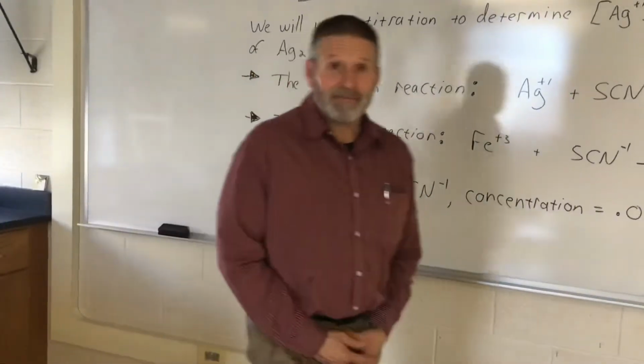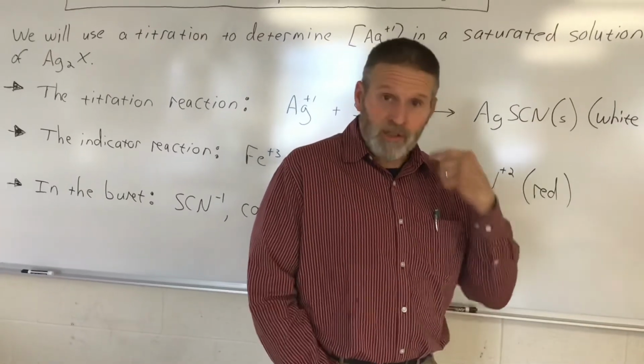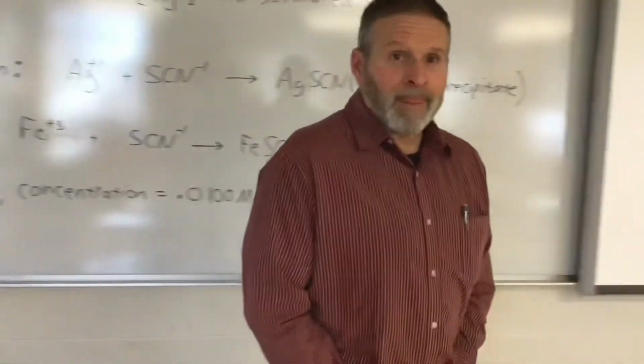Last titration of the year, Mr. Hubble. I believe it is. Yep. Normally I have Kleenex out because students are crying. Yes, I know. Say goodbye to the burettes. It's a sad day.